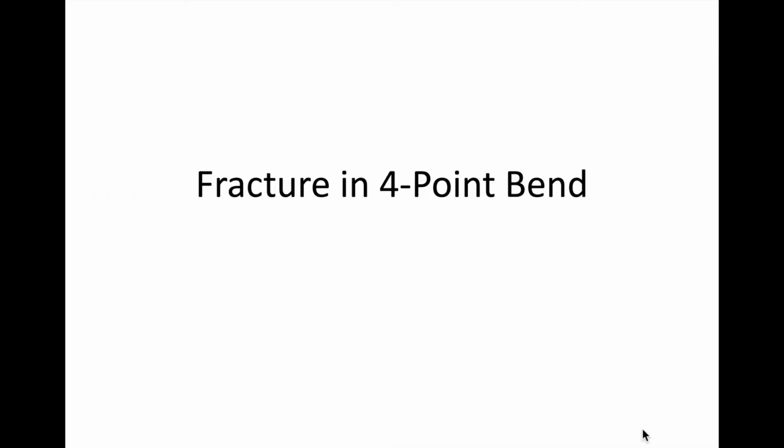All right. So in today's lecture, I want to talk about two topics. I want to talk about fracture in our 4-point bend flexure setup, so what that looks like and how it initiates and so forth. But then I also want to preview the SEM EDS component of the lab that we're going to do for compositional analysis. So I'll break up the video into two parts. And so the first one, we will talk about the fracture and 4-point bend.